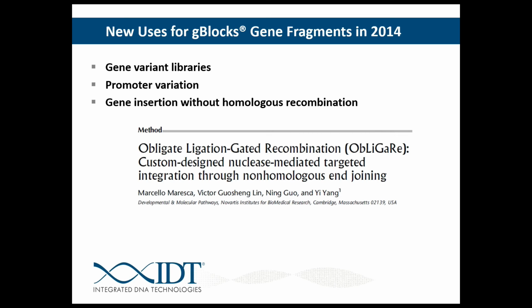And this is particularly useful in cells that lack homologous recombination, or at least are downregulated in homologous recombination. So some exciting new methods out there, and I'm sure in 2014 we're going to see a lot more methods like this.